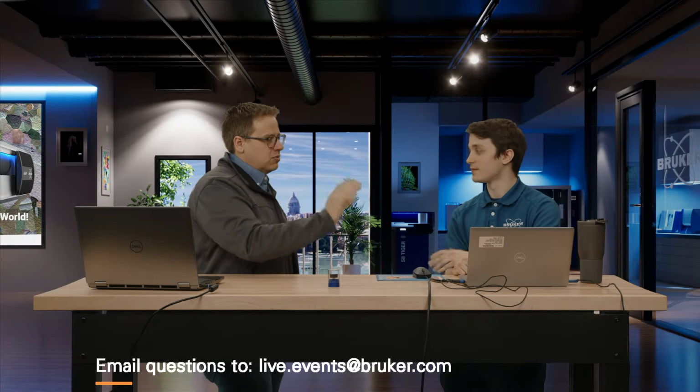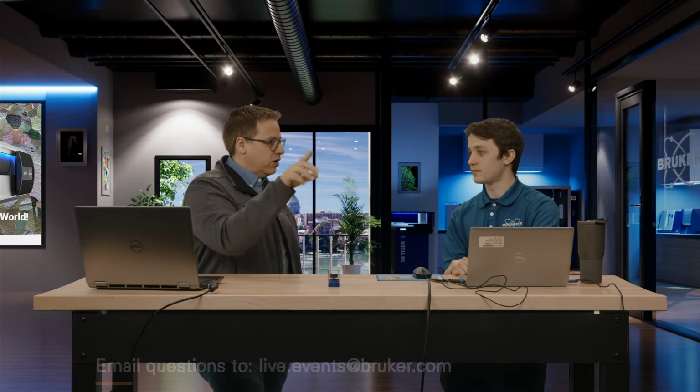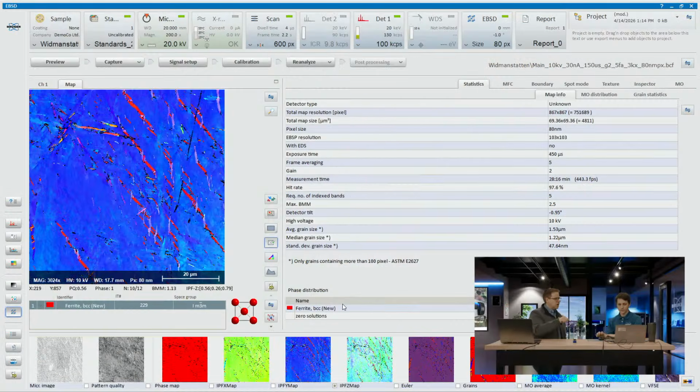So now, in terms of the software, this is still kind of a smaller area. How long did this map take? It took about 10 minutes. About 10 minutes, so similar to the live one we were doing. Actually, in truth, this one is a little slower than the one we show up there. So this is about a 30-minute map. Okay, 30 minutes. But the detail in 30 minutes, that's amazing.